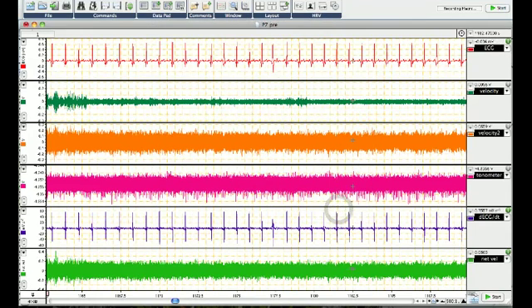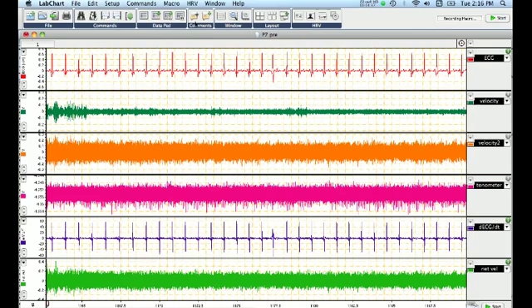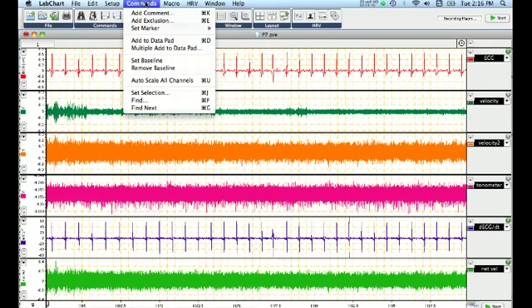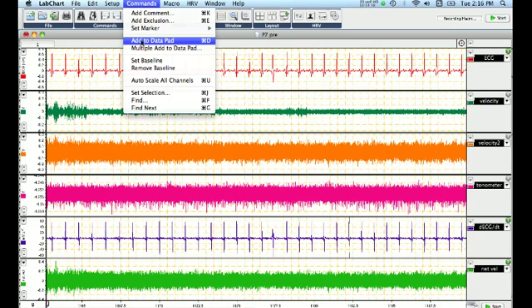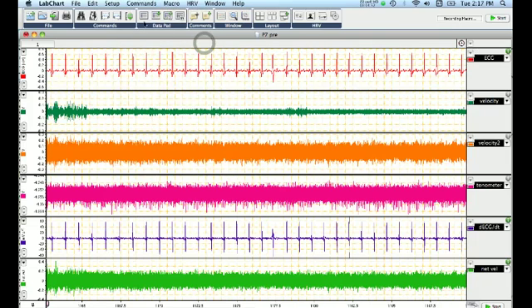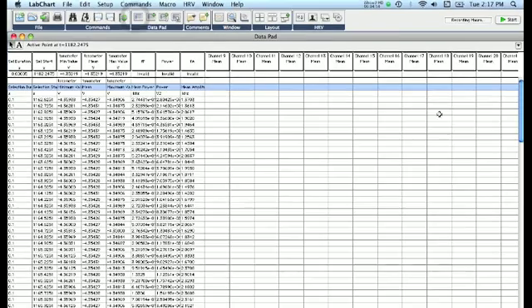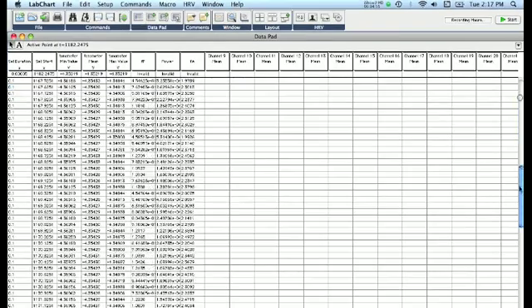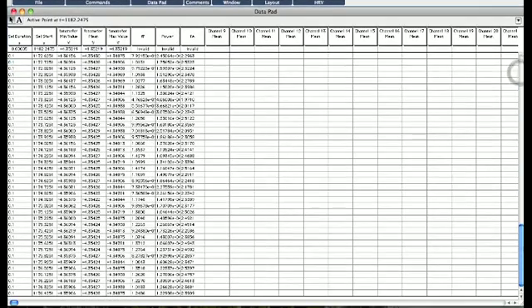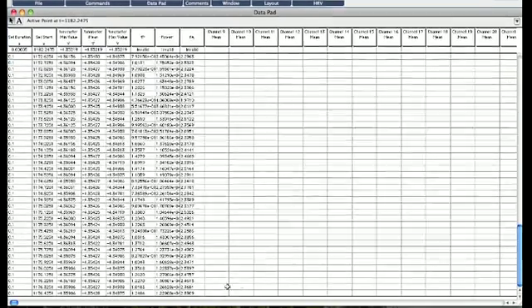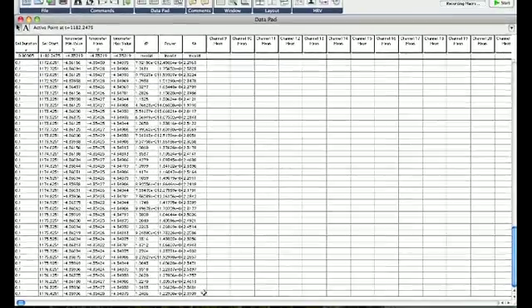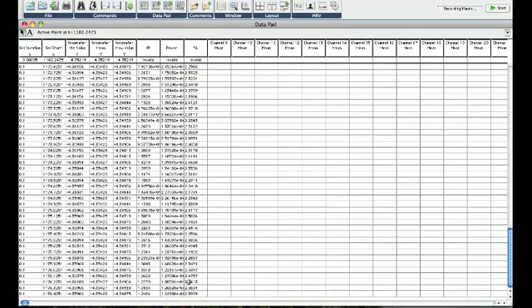We want to now take that information, so basically the position of this in the time domain, and add that information to the data pad. So to do that, we just add to data pad, or hit command D. What that does in the data pad is creates one entry at that particular time.